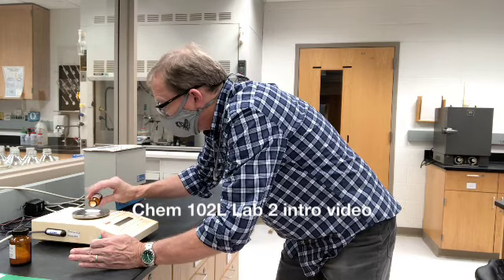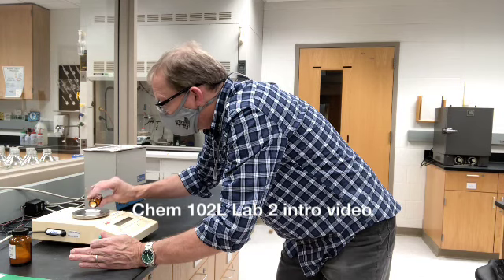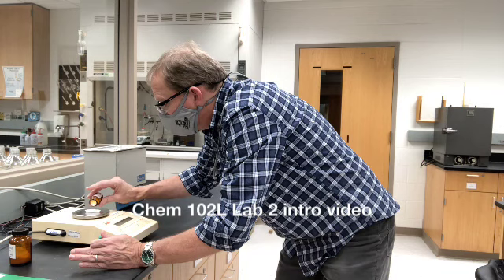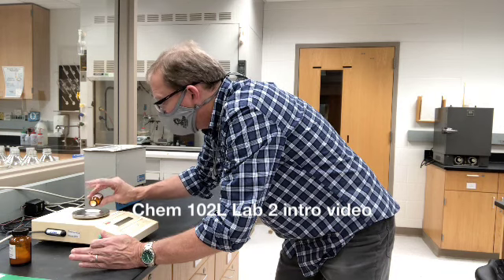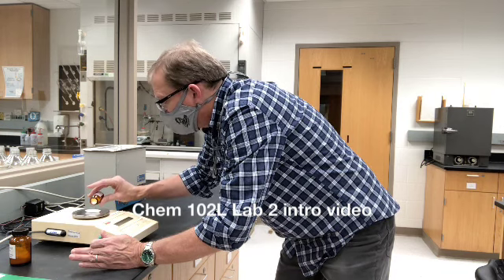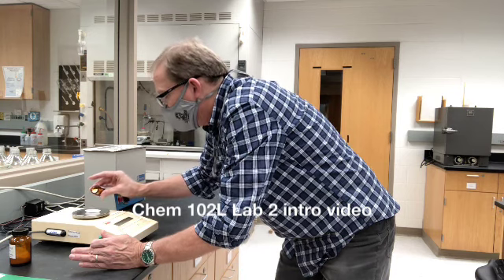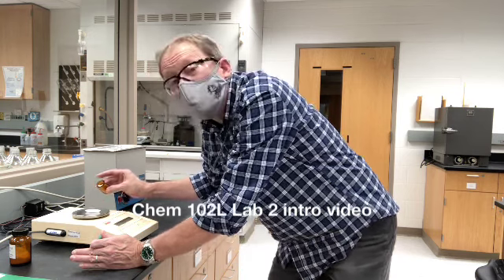So I'm just going to be kind of careful. It's best if I just approach it. I don't want to take too much time, but now I'm at 0.64. And you wait for the new amount. And I'm at 0.76. Now that's pretty close to 0.8.